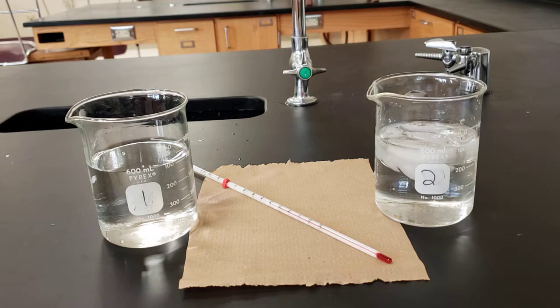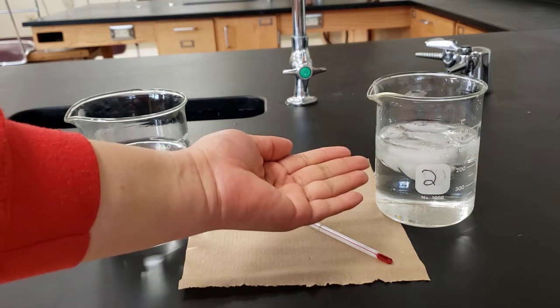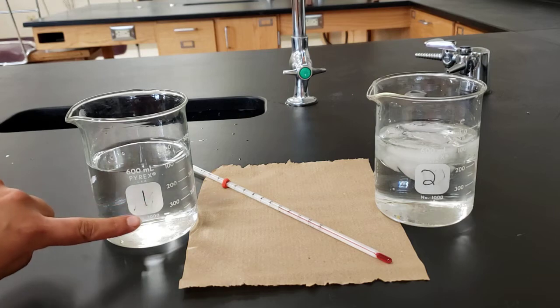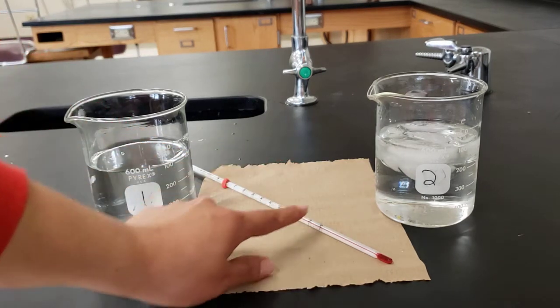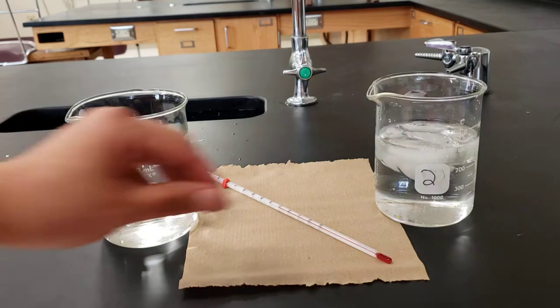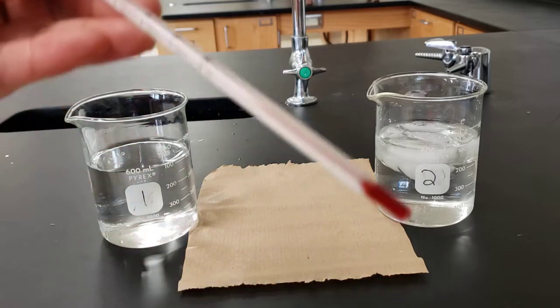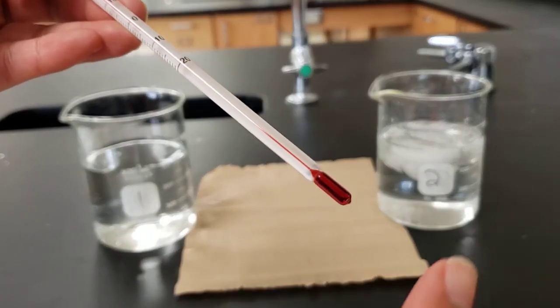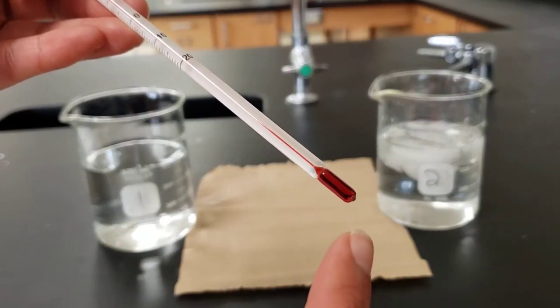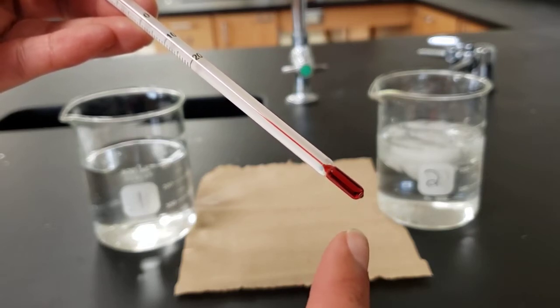So here at our lab station, we have 2 beakers, each with a solution of water. We have beaker 1 and we have beaker 2. We also have our handy dandy thermometer. Our thermometer has a couple of main parts. You'll notice that it has a red or colored portion here at the bottom. This is filled with liquid alcohol, colored alcohol.